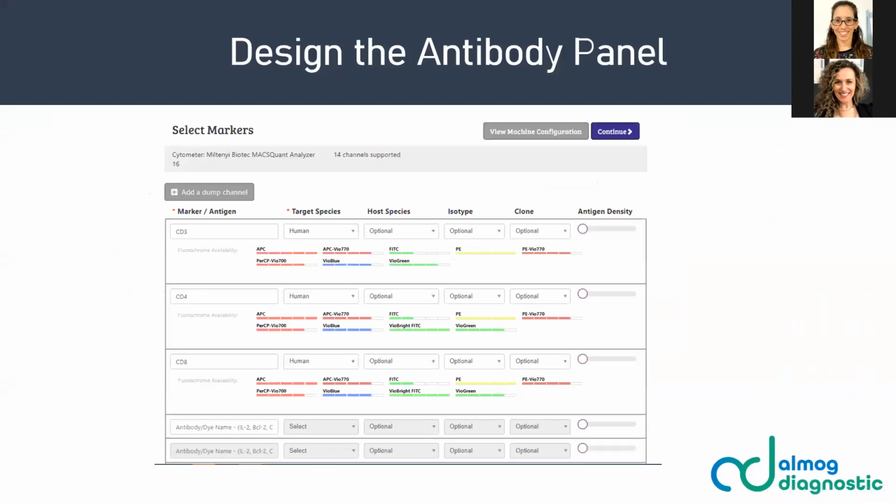You get this screen, and there you can select the markers of interest. Let's say you can type in CD3, CD4, CD8, or of course many other antigens that are of interest. But one step before, you can type in the instrument you are using.